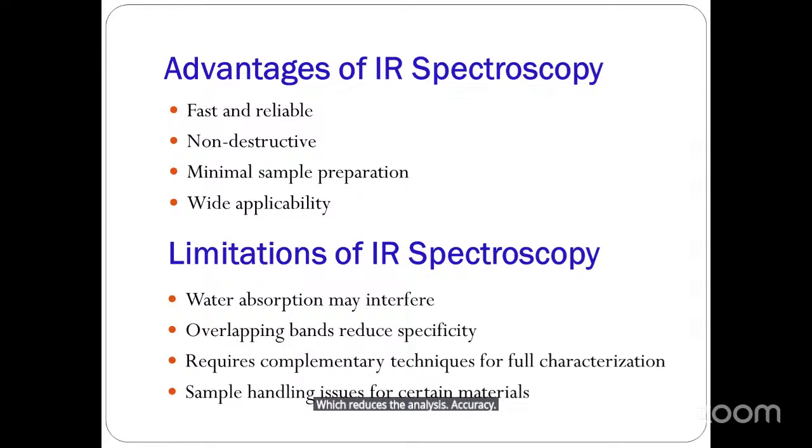The only problem with IR is that we cannot totally rely on IR. For complete characterization of an organic sample, we need NMR, we need mass, we need HPLC.